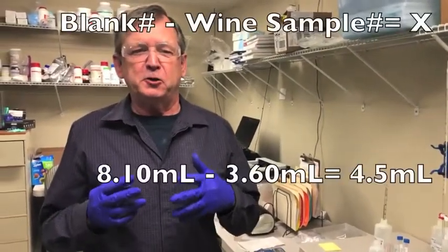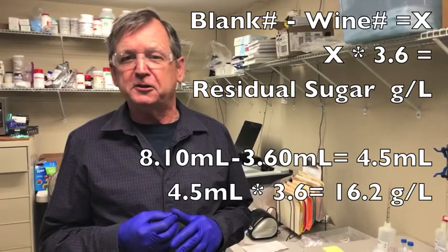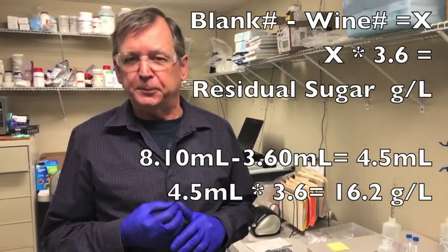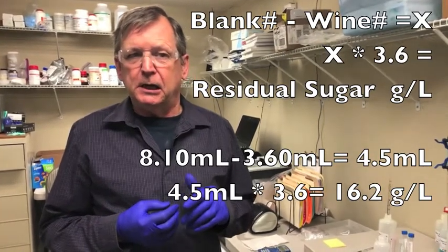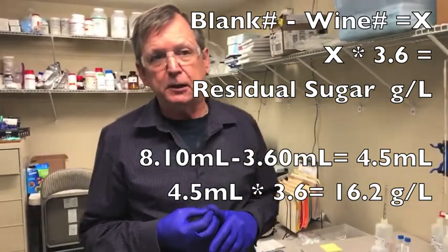By taking your blank number and subtracting the number your wine sample gave you, then multiplying that difference by the factor 3.6, you'll get the residual sugar concentration in grams per liter. Bear in mind that number represents reducing sugars — other sugars that might be present may not be included. For example, sucrose is not a reducing sugar and won't appear in the analysis unless you follow the hydrolysis method given in the manual for determining sucrose if known to be present in significant amounts. It's a pretty simple test — you get accurate results that will compare well with results from other methods.